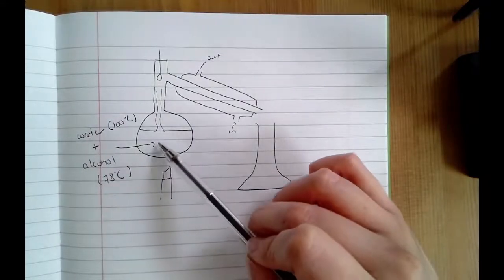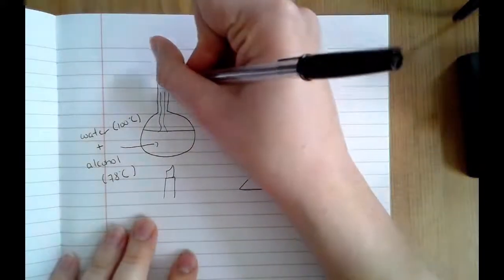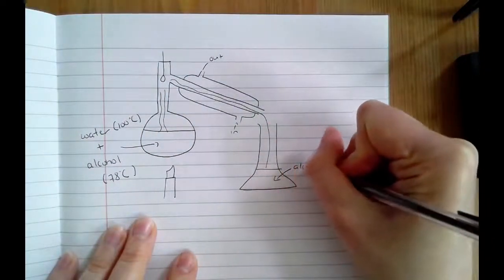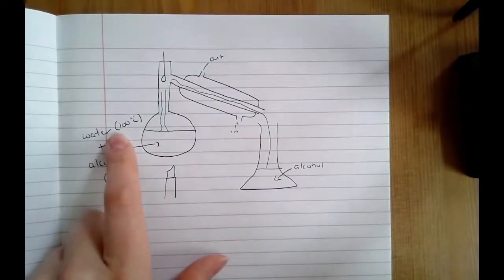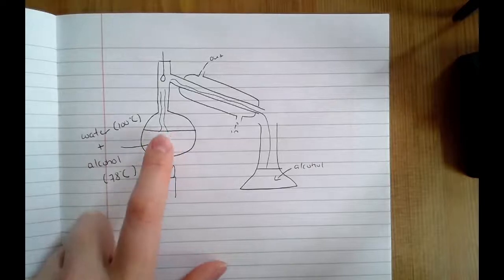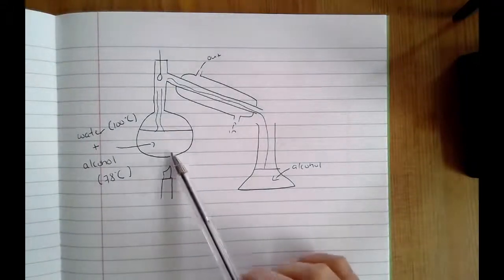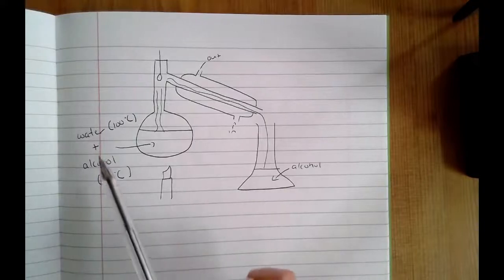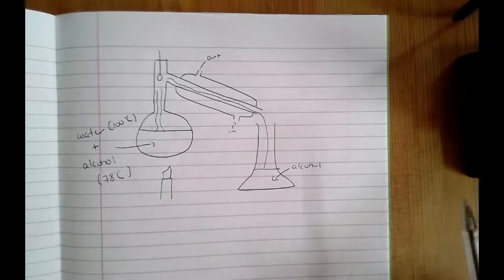So I heat it to 78 degrees Celsius. The alcohol will evaporate, the hot air will rise, it will hit the cool condenser, and your alcohol will collect here in your flask. As long as you're not heating this mixture above 100 degrees Celsius, then the water will remain as a liquid in your round bottom flask. And at the end of the experiment, you'll have water in your round bottom flask, you'll have alcohol in your conical flask. So if you've got liquids that are mixed together and they've got different boiling points, you can also use simple distillation to separate them.